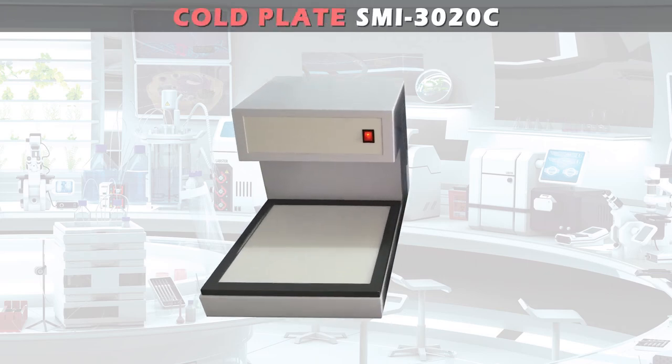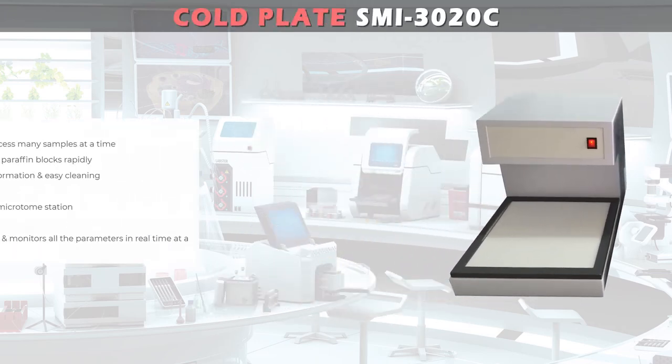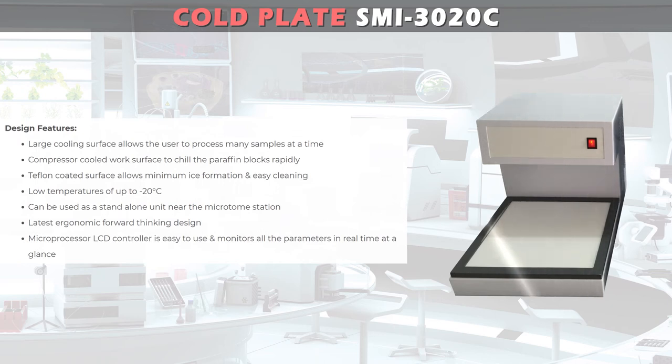The Jindal New Modular Cold Plate is a stand-alone unit to meet the needs for a histology lab. Its large cooling surface allows the user to process many samples at a time. The compressor-cooled work surface chills paraffin blocks rapidly, and the Teflon-coated surface allows minimum ice formation and easy cleaning.